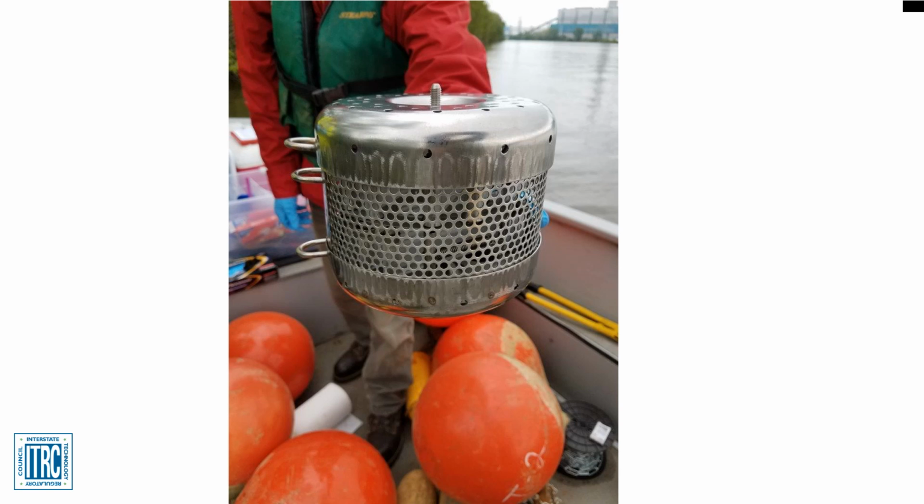The sampler must remain submerged for the entire deployment period, but not buried in the sediment, to achieve data representative of the target media. If the device is exposed to air, there could be a potential loss of chemicals with higher volatility from the SPMD and accumulation of chemicals from the air, resulting in measurements of non-target media. It is important to keep the device shaded to prevent the photodegradation of some light-sensitive chemicals, such as PAHs.